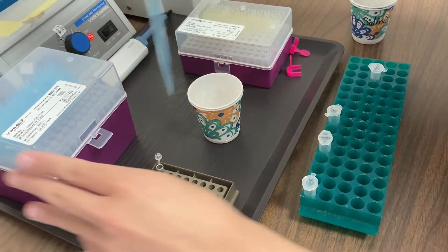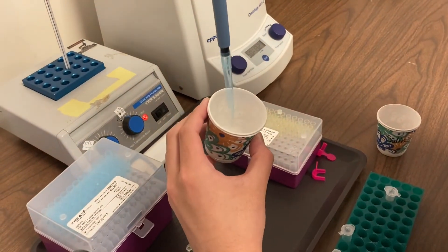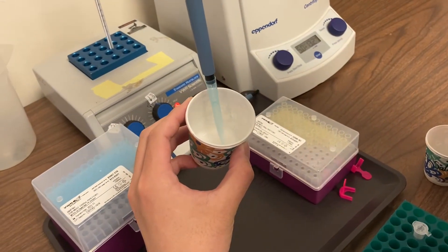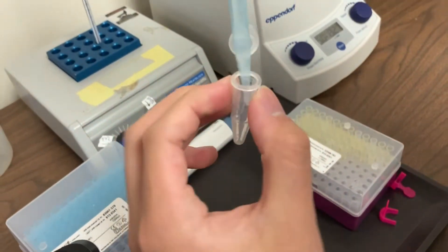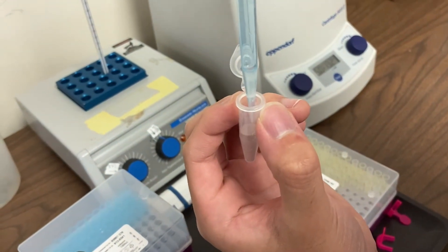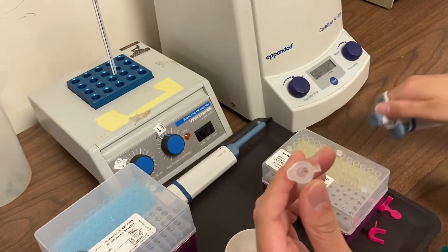Next, attach a tip to your micropipette and adjust the volume to 1000 microliters. Then you'll use your micropipette to draw up your re-suspended cheek cells in saline and add that volume to your microtube. When you've finished, cap your tube, put your tip in the wastebasket, and you're ready for the next step.